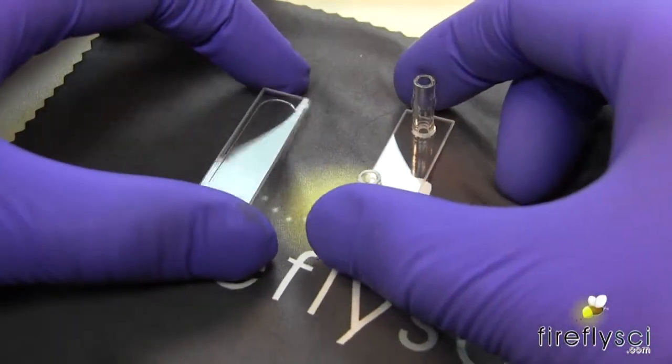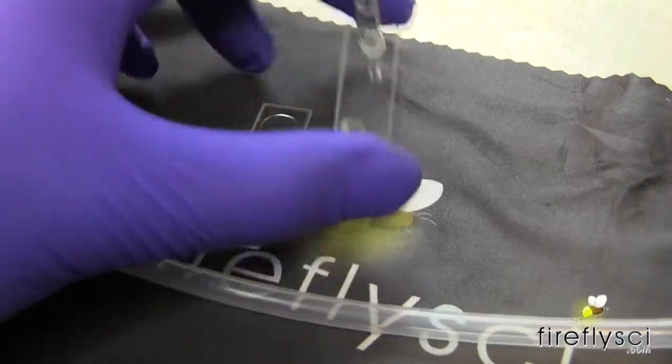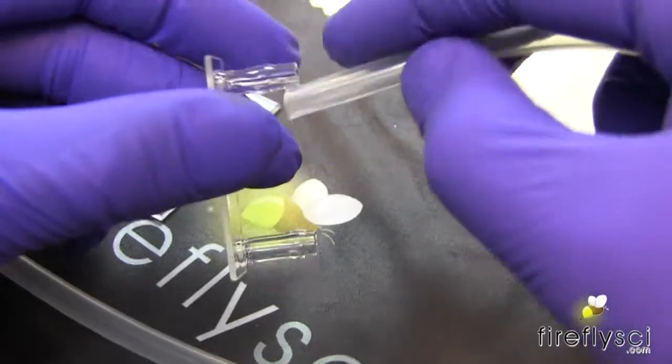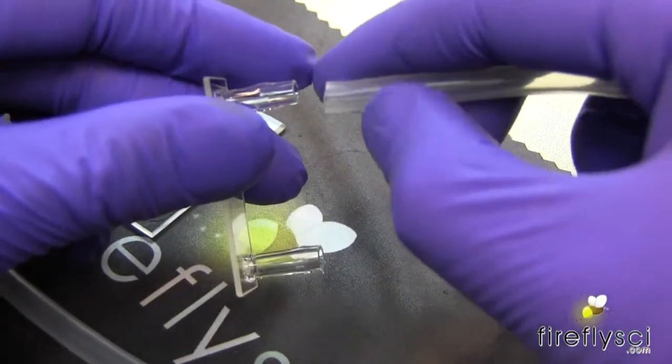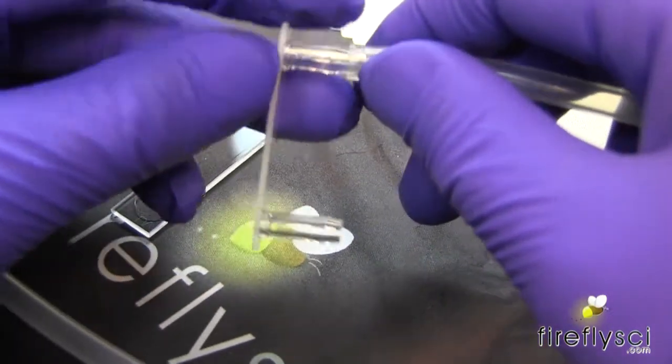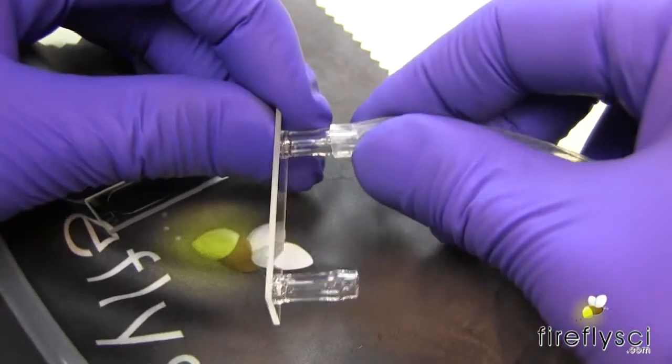Okay, so the first thing you're going to want to do with this is put your tubing onto the connectors here. So it's just a matter of pushing them on past these little bulbs here. Just gently push your tubing on and don't force it because you can break these connectors off if you're not gentle with them.